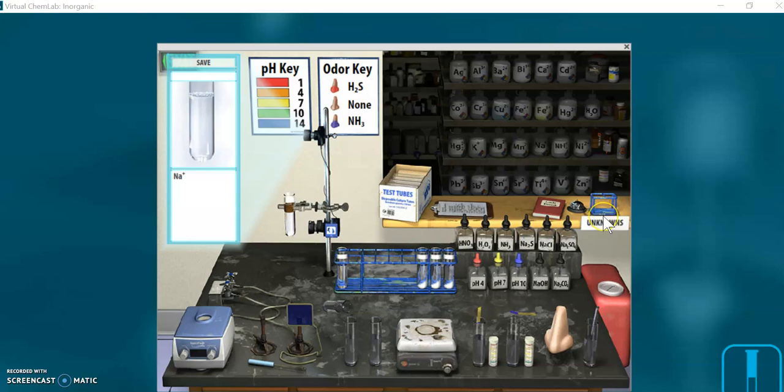You just see the arrow there where the mouse pointer is. It would turn into a hand if that were an active option to use. So what you actually have to do, which it doesn't say on the worksheet, what you need to do is clear out the lab. Click on this red waste can. And it clears out.